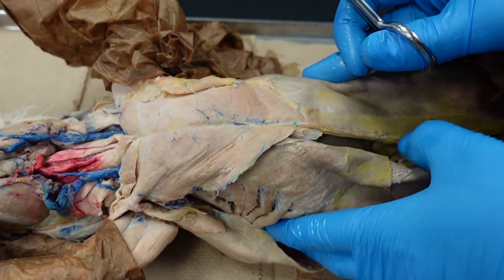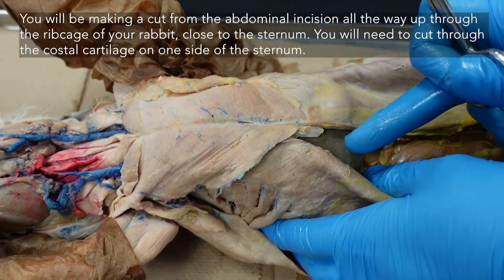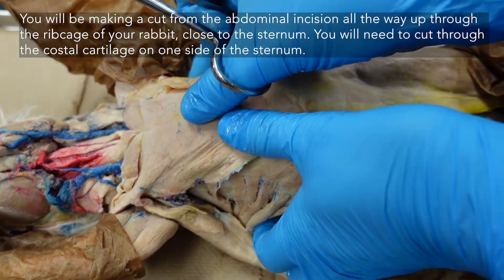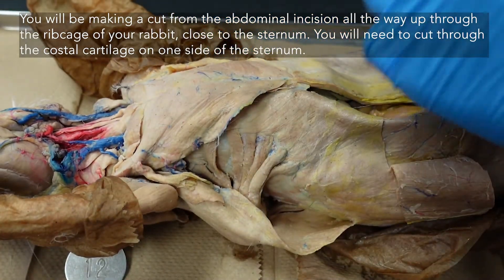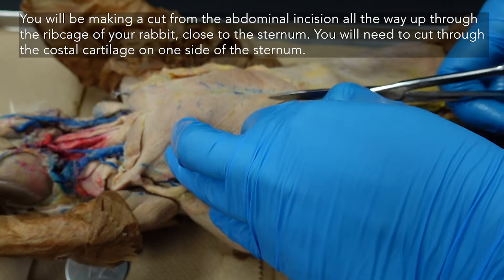I'm going to try something a little new this year just to make things less complicated. We're going to extend that abdominal cut all the way up one side of the sternum and then open the ribcage like a book, leaving the sternum in place so we can potentially see the internal thoracic intact.